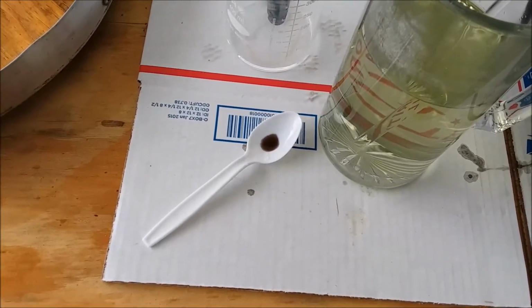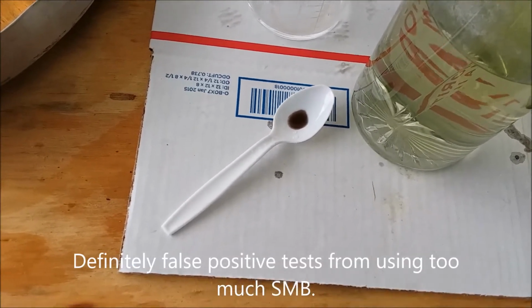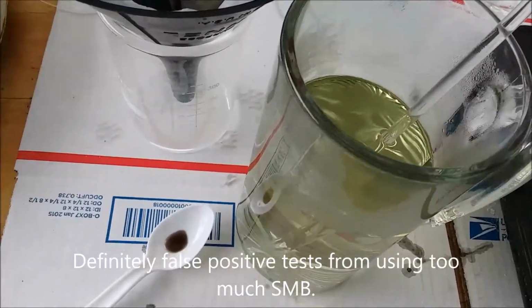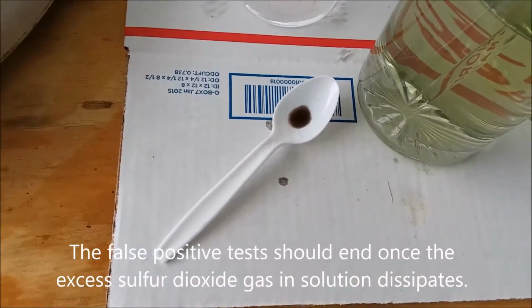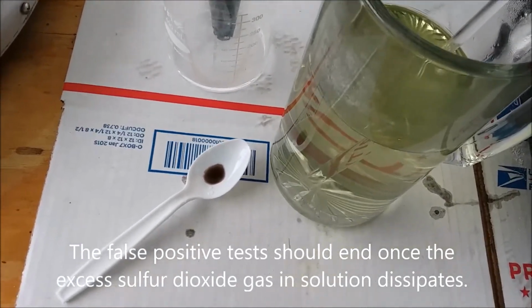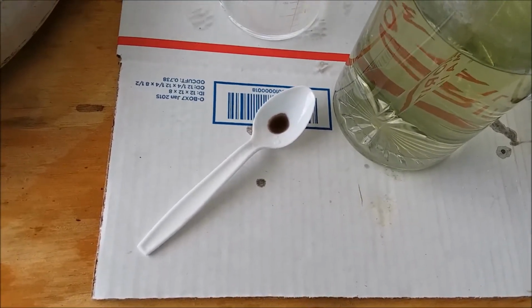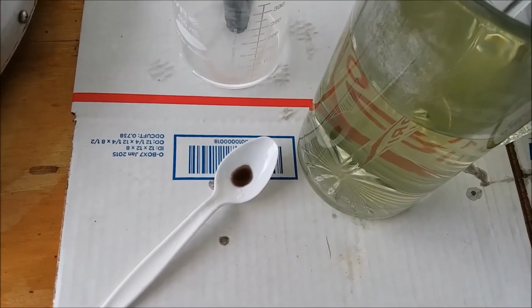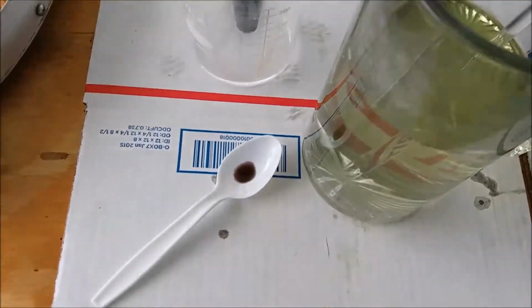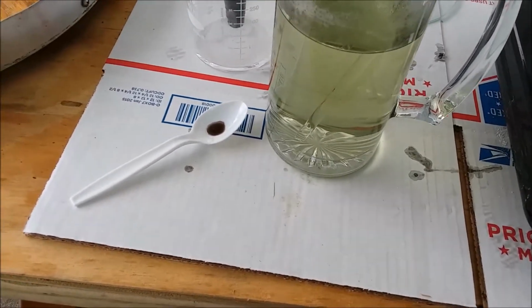I just did another stannous chloride test, and it's got to be a false positive. It's like this stuff is still loaded with gold, and I'm not believing it for a minute, because the stannous chloride test I did immediately after the drop showed nothing but maybe some platinum group metals in there. So I'm thinking this has got to be a false positive, maybe from adding extra SMB, I don't know. But I don't believe there's really any more gold in there.